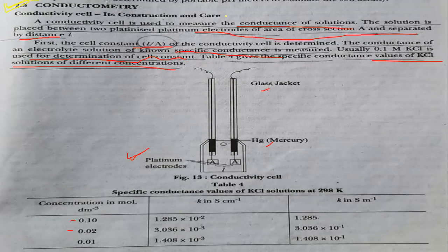The solution is placed between two platinized platinum electrodes of area of cross section A and separated by distance L. If you see in the diagram, these are the platinum electrodes. The area of cross section is A and the distance between them is L. The cell constant is L upon A, the distance upon area, of the conductivity cell.